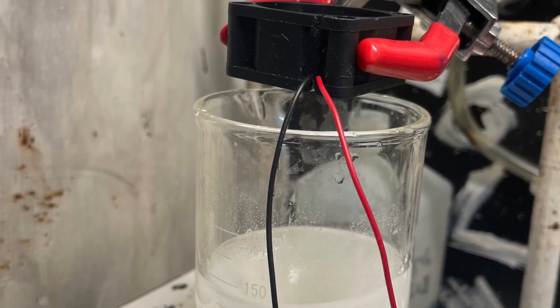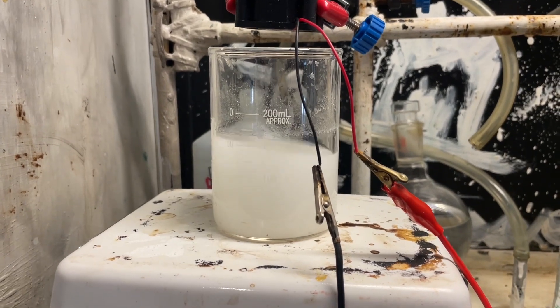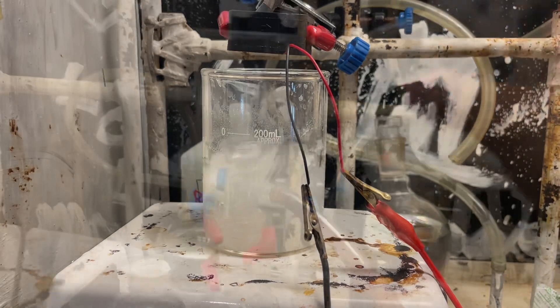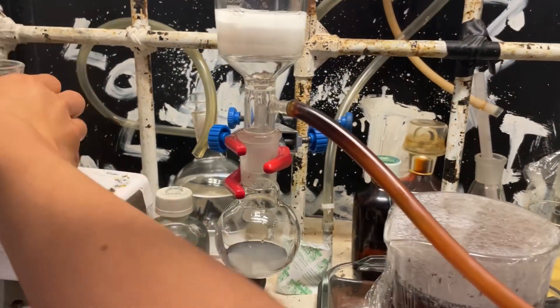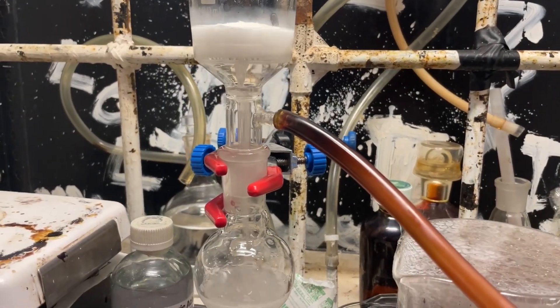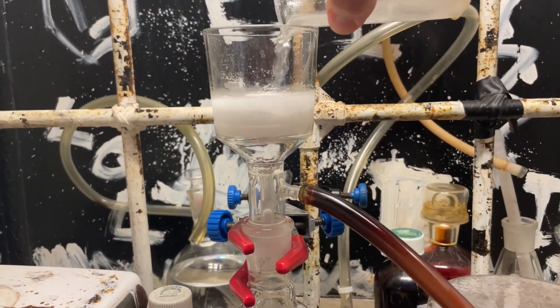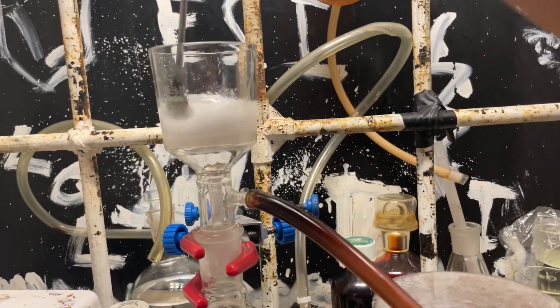Then I evaporate the solution down as much as possible. This stuff is not super soluble in water, so we can just filter right off — very convenient. Here's our final product. Wash with a little ice-cold water, then dry it on the pump, and wash again with more ice-cold water to remove as much potassium hydroxide, potassium chloride, and potassium iodide as possible.